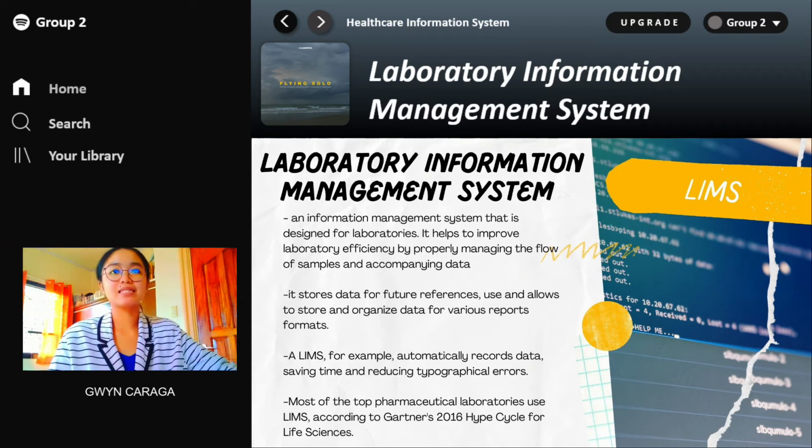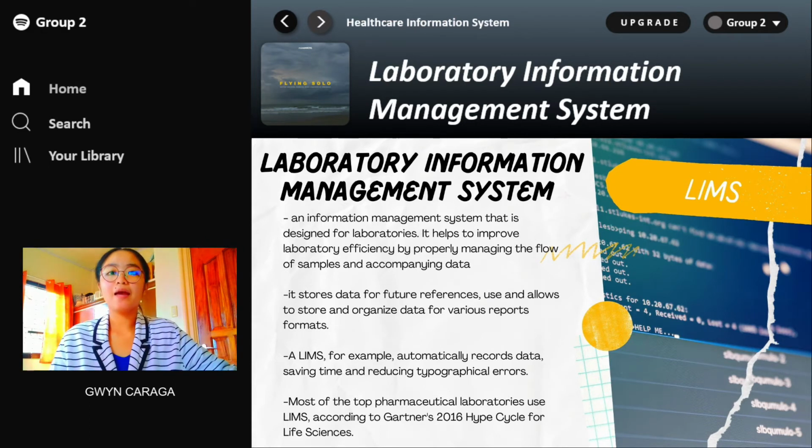So it means that LIMS helps us do the job more easily inside the laboratory because it provides accuracy and efficiency in the lab. It also records information automatically, and just like what we mentioned earlier, it reduces typographical errors and automatically saves time. LIMS allows us to effectively manage the flow of samples to improve lab efficiency.